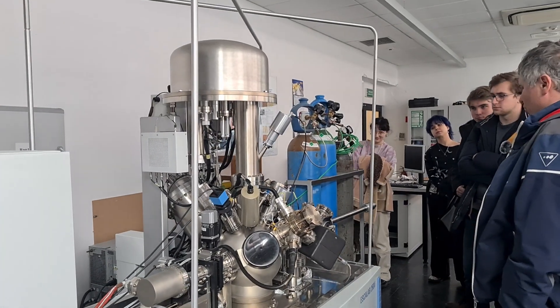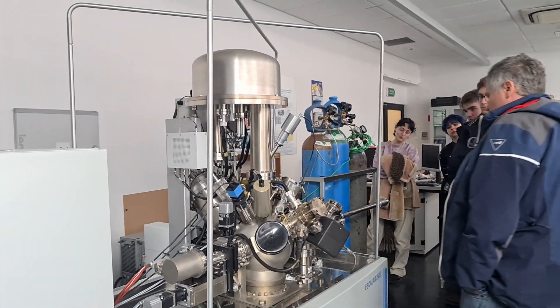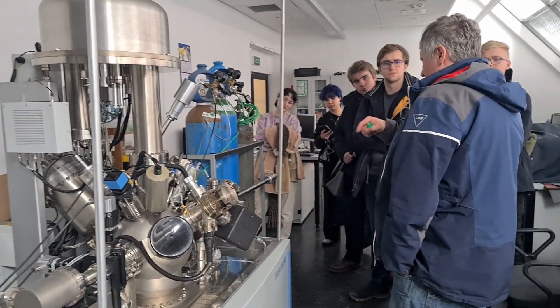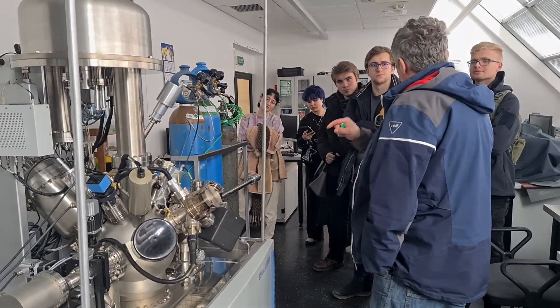Na bazę to bardzo dużo dokładności. Tu w środku jest próżnia na poziomie 10 do minus 12 tora – tam jest kilkadziesiąt lub kilkaset atomów powietrza w środku, tylko.